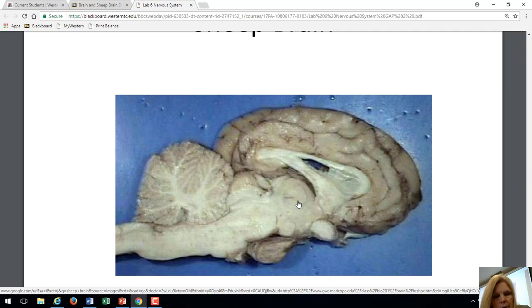So you find the thalamus, and then the pituitary gland is here. It's been cut in cross-section, but this is the thalamus, so therefore this is the hypothalamus. This shiny space underneath the thalamus is the hypothalamus. And this is actually part of the optic nerve and optic tract here that's been cut. But this is the hypothalamus.